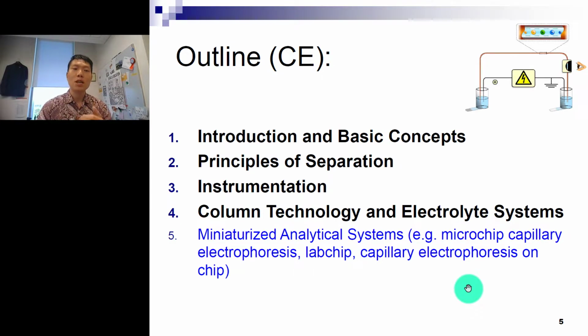And the last part, we can speak about the miniaturized analytical systems. Like how small can the instrument go? And the purpose, right? What's the reason to make it so small? Any applications in our daily life, etc.